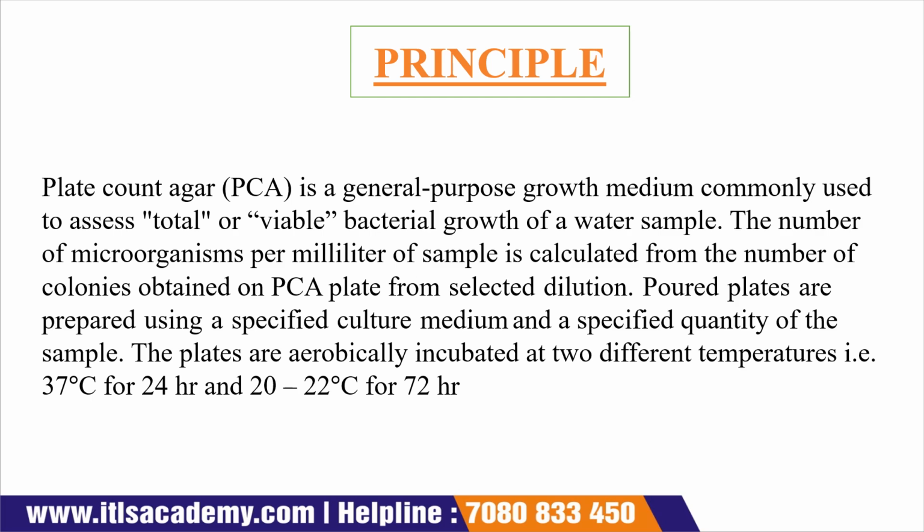Principle, first of all. Plate count agar is a general purpose growth medium commonly used to assess the total viable bacterial growth of a water sample.